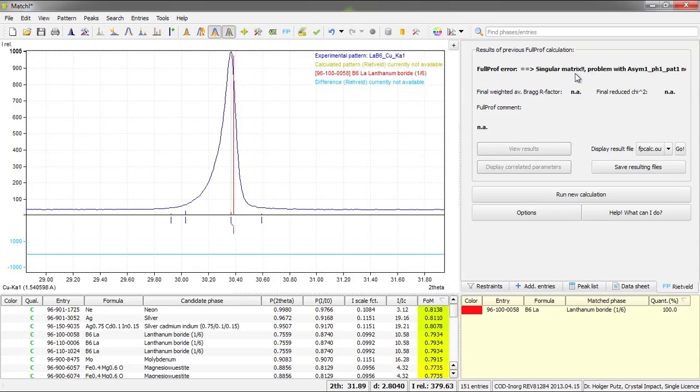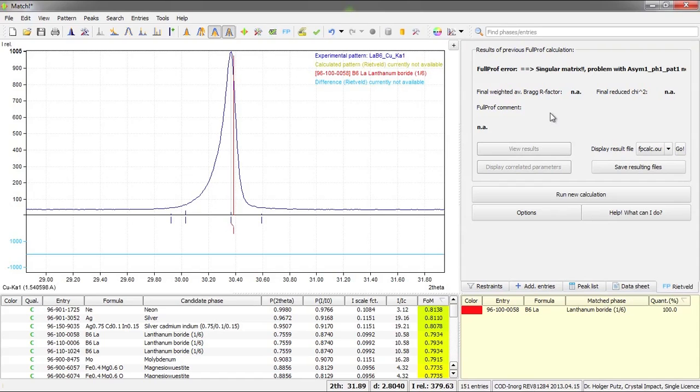Because as I have already mentioned, I have instructed full prof to vary both the two theta shift as well as the specimen displacement. This may be some kind of critical. So I would first like to correct this.